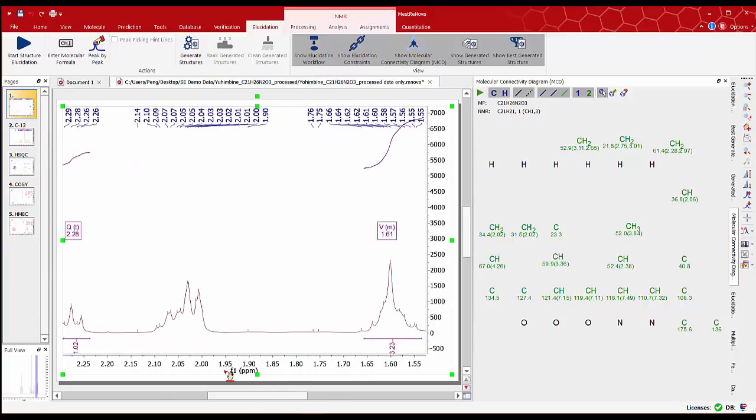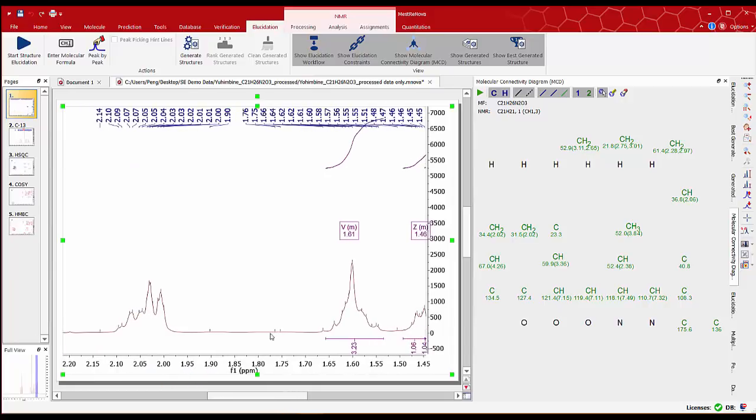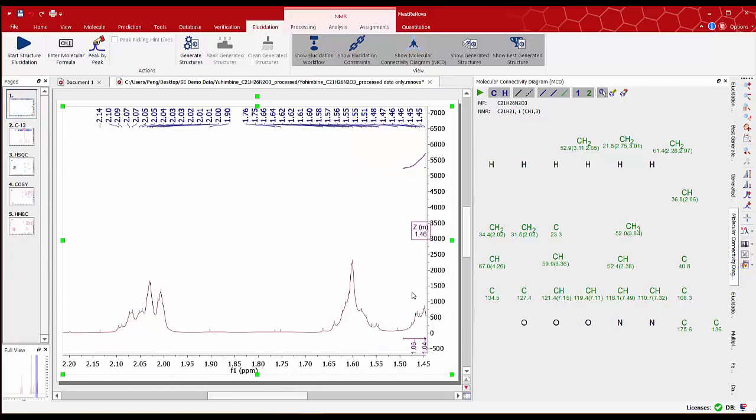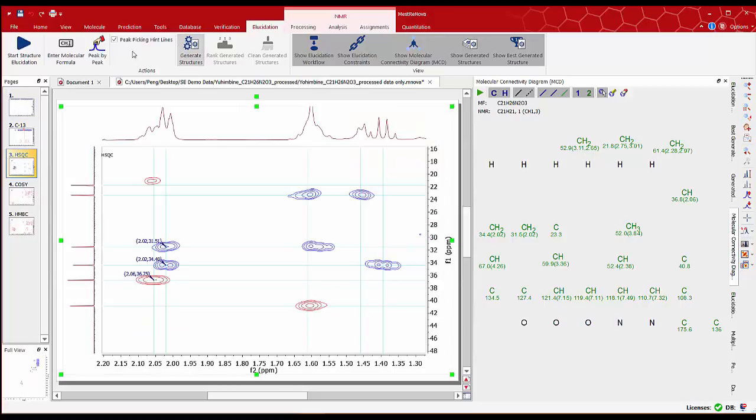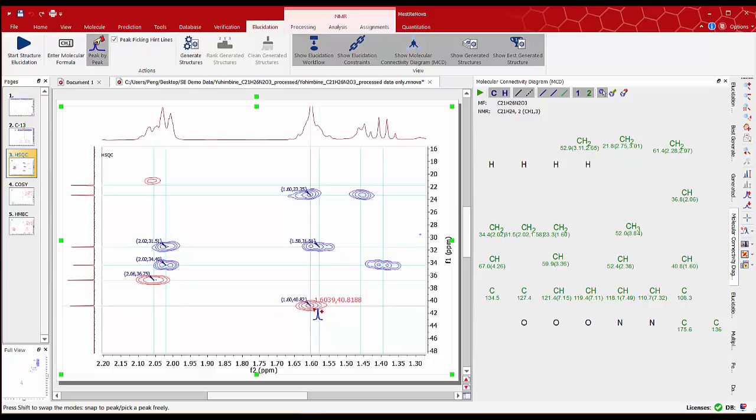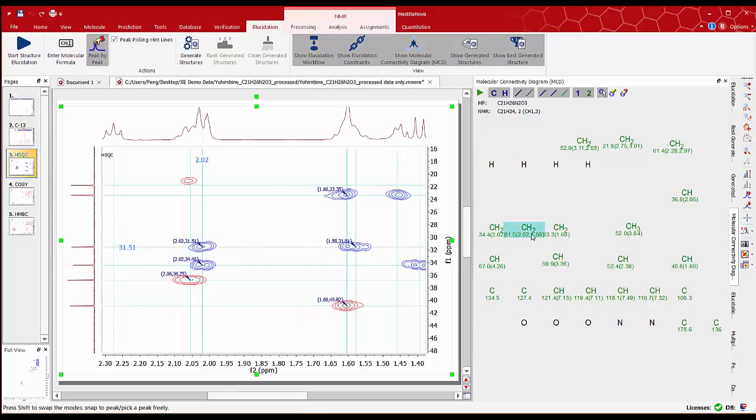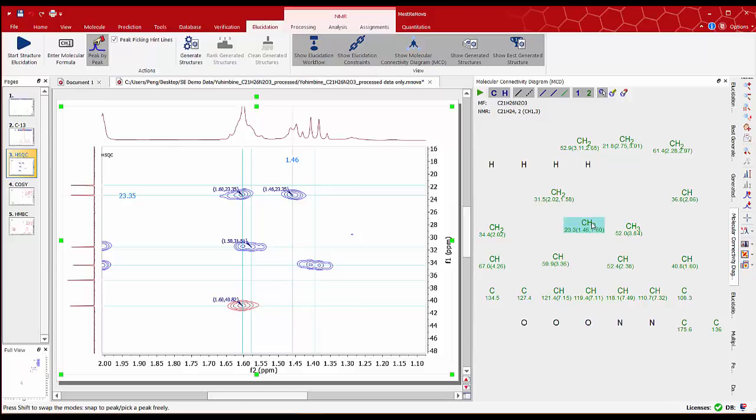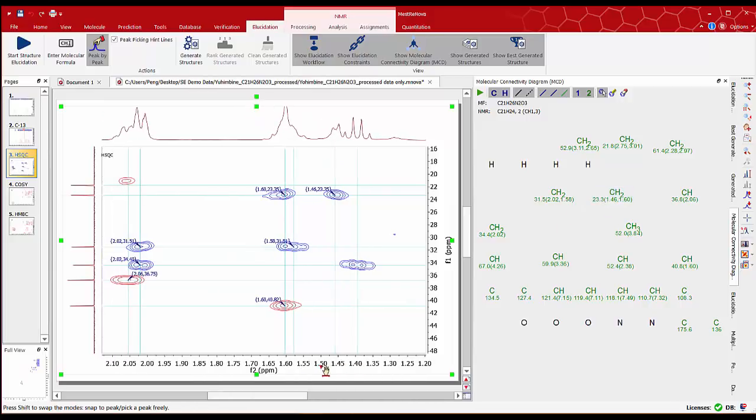We can assign in a very similar way the other multiplet at 1.6 ppm. Mouse right click and select delete multiplet and keep doing peak picking to the remaining peaks. We can tidy up the assigned groups on the MCD panel. We can continue with the peak picking for other correlations.